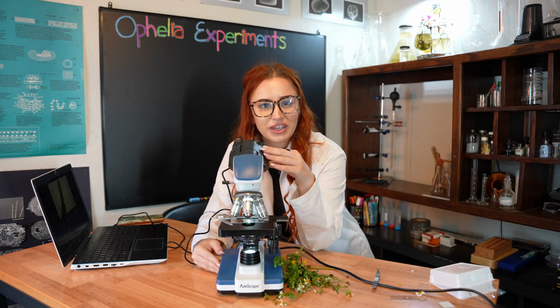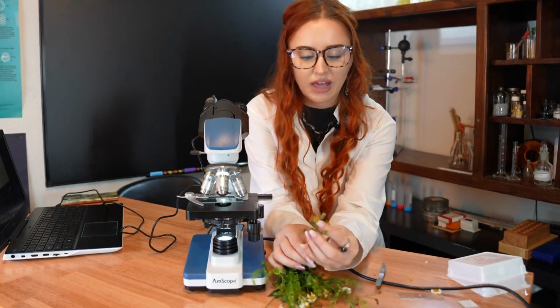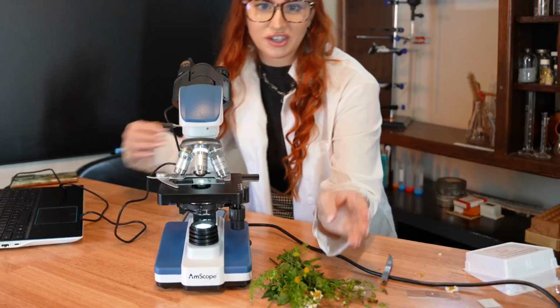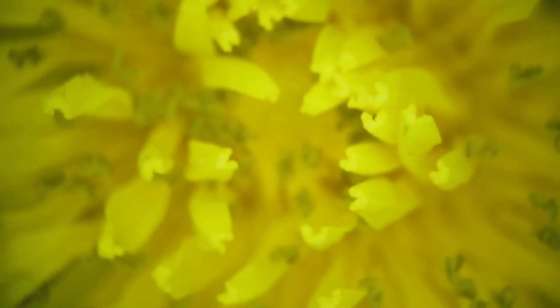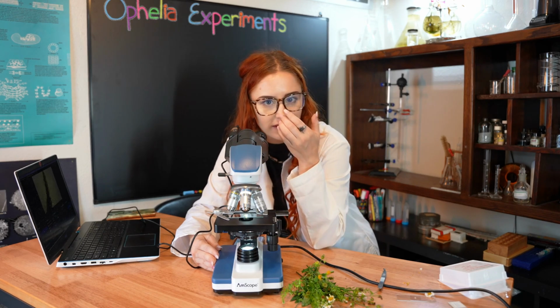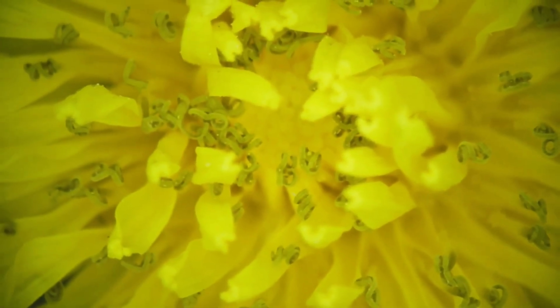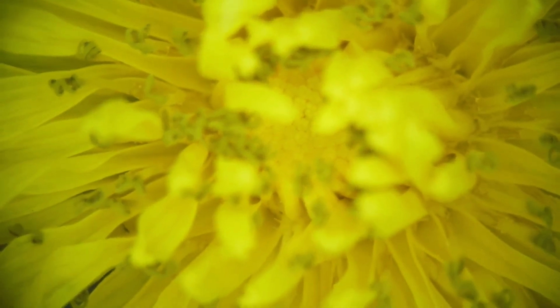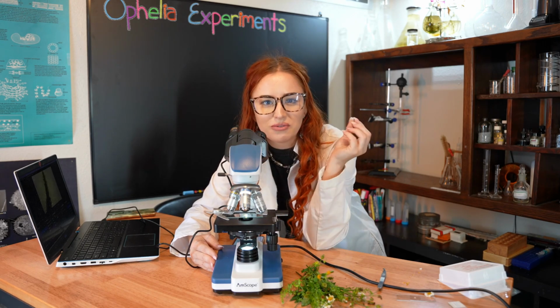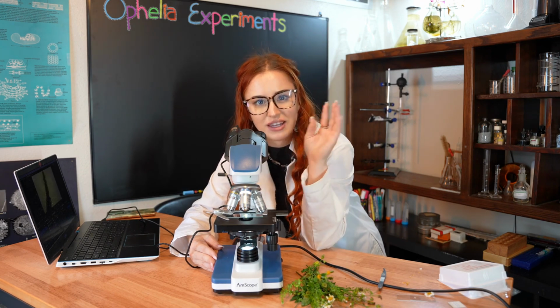Alrighty, so next we're going to be looking at the pollen grains, and we're going to be taking a closer look at this part of the flower right here. You can see this is where it's so packed full of pollen and goodies. So let's take a look. A fun fact about wildflower pollen is that each plant produces a pollen that's very specific in shape and structure. And they come in all varieties, like spiky balls, oval, fluffy. It really is truly amazing how much diversity we get in our plant life.